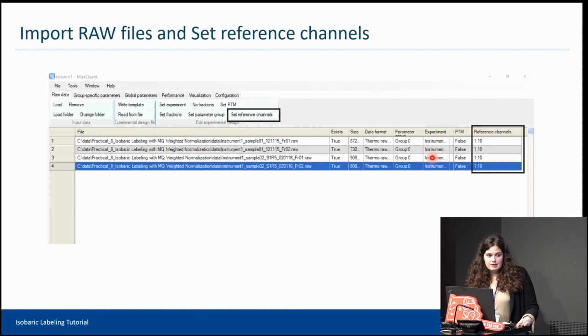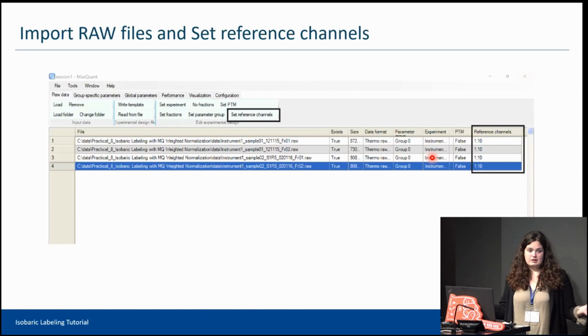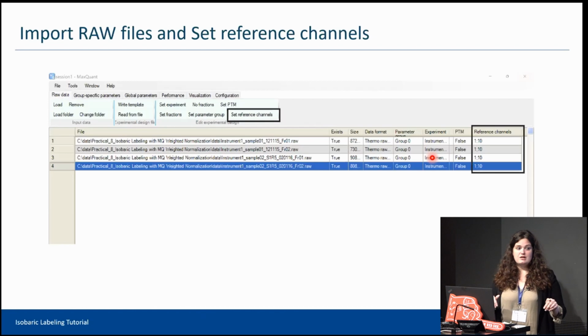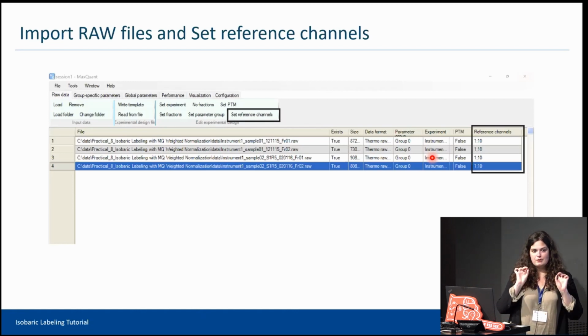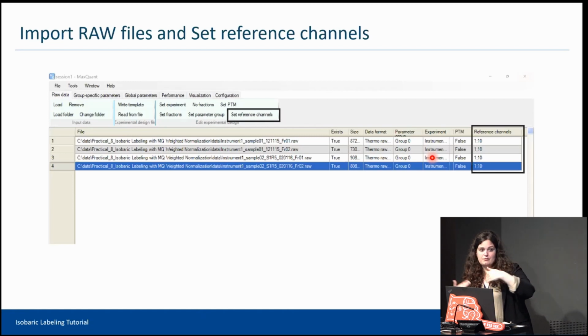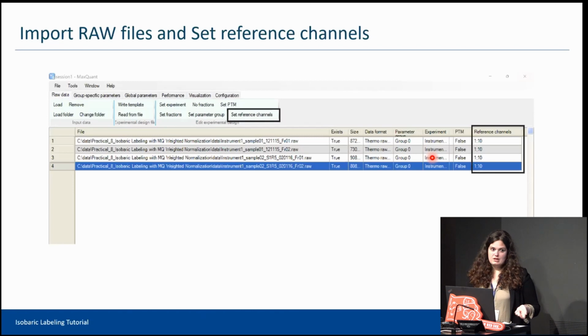If you go to the paper, you will see that there are more raw data because it's a bigger study, but I'm sorry, we could not provide all the raw data in the USB drive. You can download them whenever you want. However, the protein groups file, the output that is in the USB drive, is the one from when we processed all the raw data. The pure raw data provided are only the 4 you see here, but for MaxQuant, all the raw data in the private repository of this paper were used, because we needed to reproduce exactly this human body proteome map that they explain in the paper.